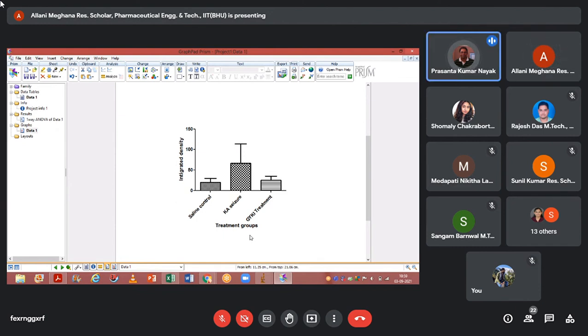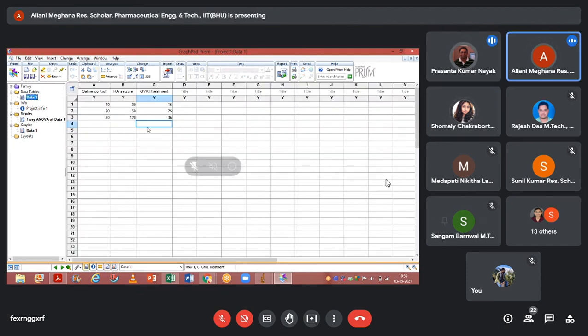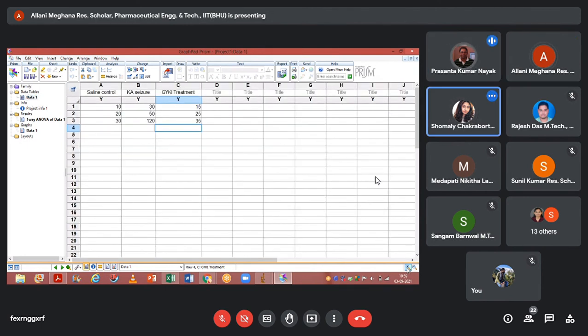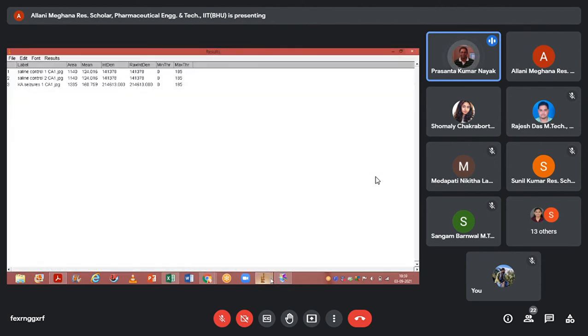Do you think it is enough, Kamali? So the data we have put in the columns like 10, 20, 50, what are those? What are we supposed to bring there? Why did we not show you from the results that we actually downloaded? Can you go to that Excel sheet, Alani? We are supposed to copy from there only.